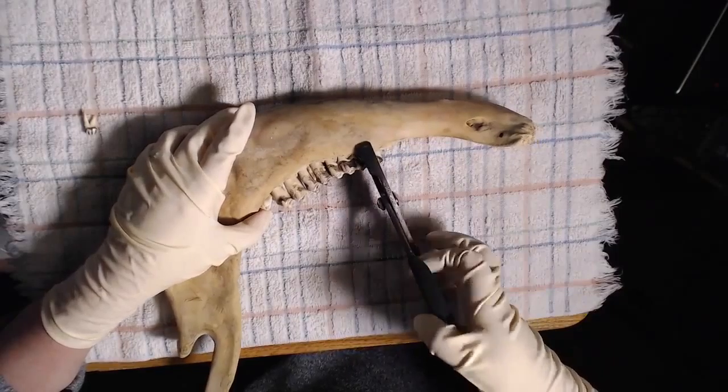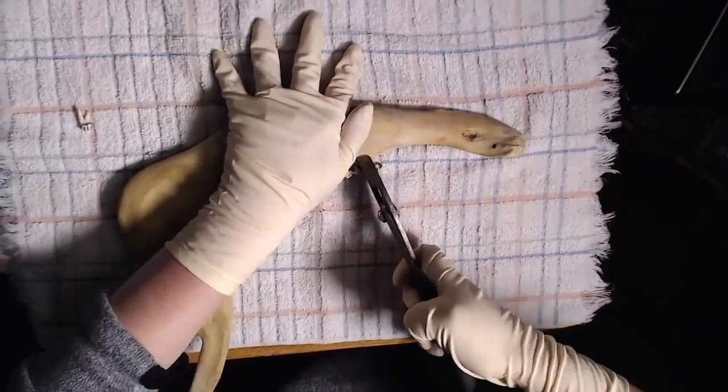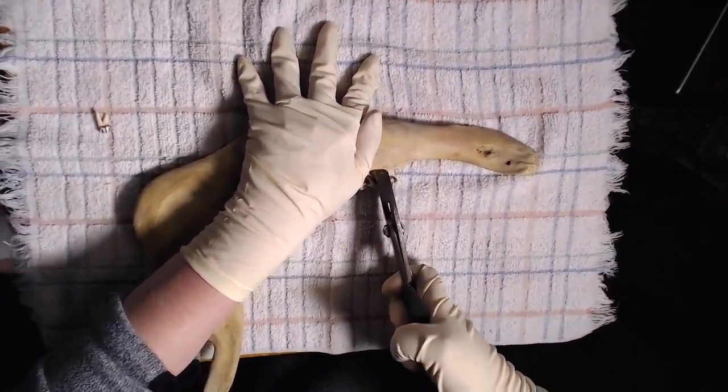So you may want to just take your pliers and grab on here, and then just yank as hard as you can. Nope, not gonna.